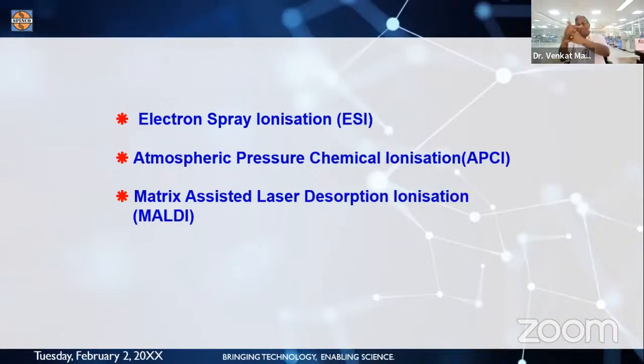Because of all this technology available before you, there is no compound that goes unidentified by mass spectrometer at such a low concentration.